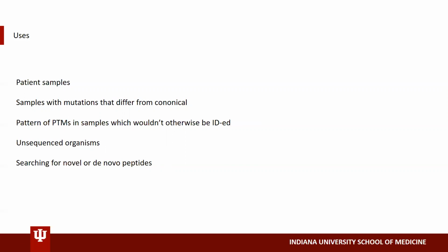I will say that you might guess that this takes a significant amount of time, and it does. I would say that running a full Peaks search all the way through Spider on a large project can take 5 days. So you really want to make sure it's relevant to the project at hand before you get into it. But it has a lot of really biologically relevant applications.